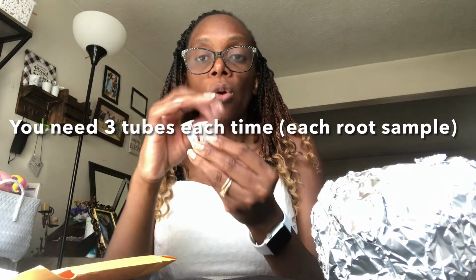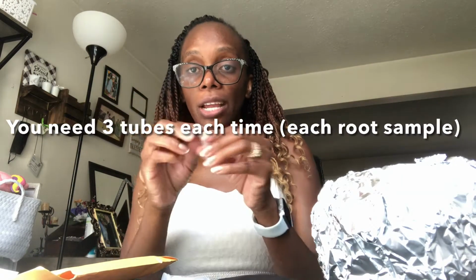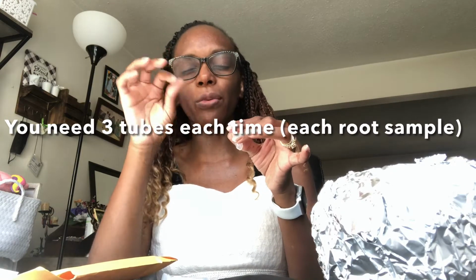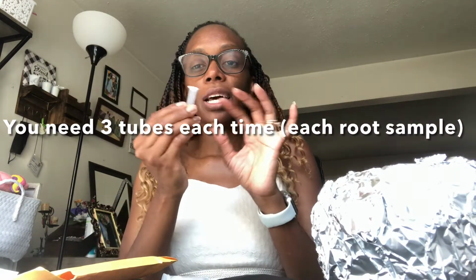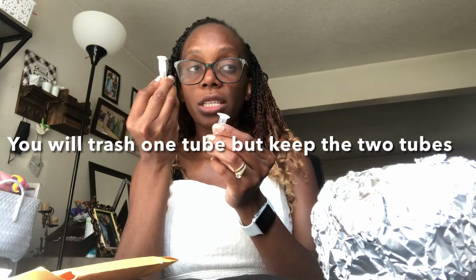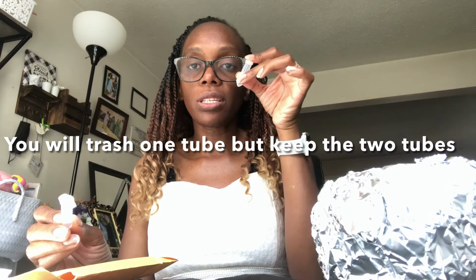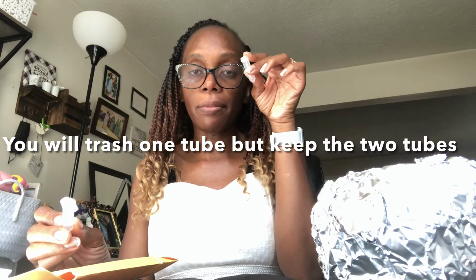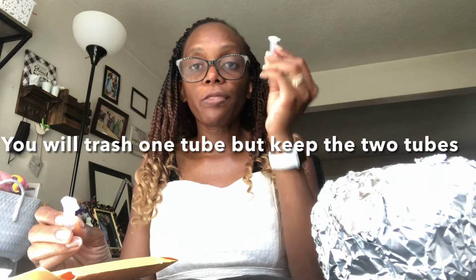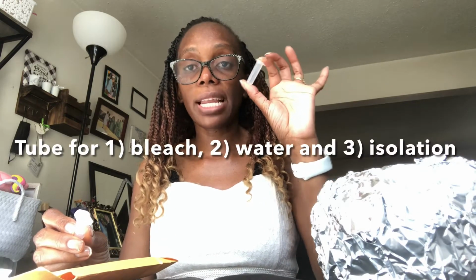One of them will be the one where we will finally do our isolation. We'll crush our root sample, our root segment. Once that is done, you can just trash it. The other 2 tubes, you can actually use. One of them we will fill with just clean water. In the other one, we will dilute a little bit of bleach and add a lot of water, and then we mix it up. The first one is going to be our bleach diluted solution, and the purpose of that is to sterilize our root segment.